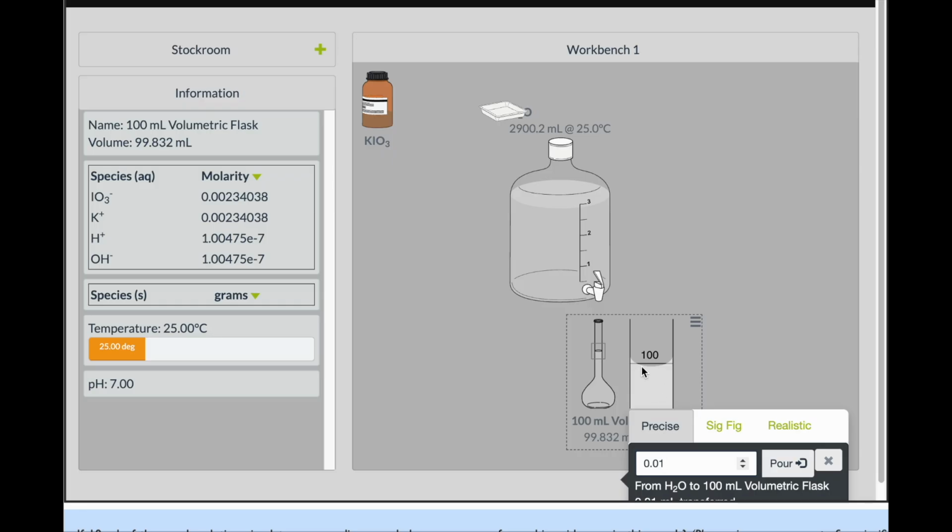I'm watching the meniscus here, and it's almost at that line. I'm going to keep on adding that slowly, slowly, slowly until I eventually reach it. Very close right now. Oh, one more click should do it. Perfect. You can see the meniscus of the solution is right at that line, and I've got 100.0 milliliters of water.